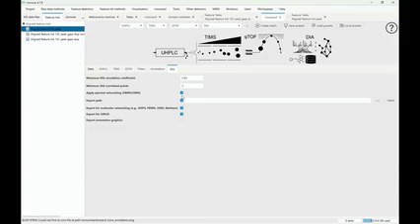I think it's always kind of straining, because you think you go to this workshop and you're going to be an expert after this, and then everything is so slow because we have to keep everyone following. But also 2 hours is actually quite a short time.